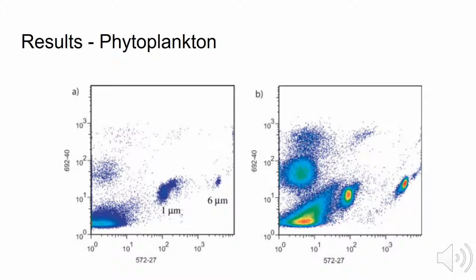The next cell type test run was to compare traditional flow cytometry to the virtual core model to classify raw seawater based on phycoerythrin and chlorophyll. Like the previous example, both graphs show similar grouping and ratio of cell groups present.